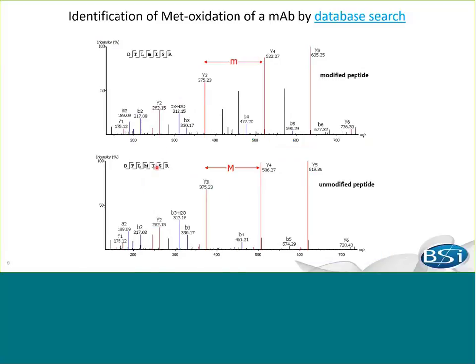Here I put two spectra of modified and unmodified peptides together so that you can easily see the mass difference of Y3 and Y4 ions between the modified versus unmodified peptide spectra.